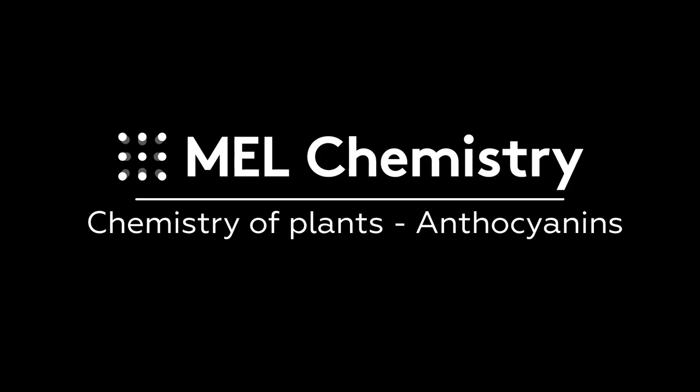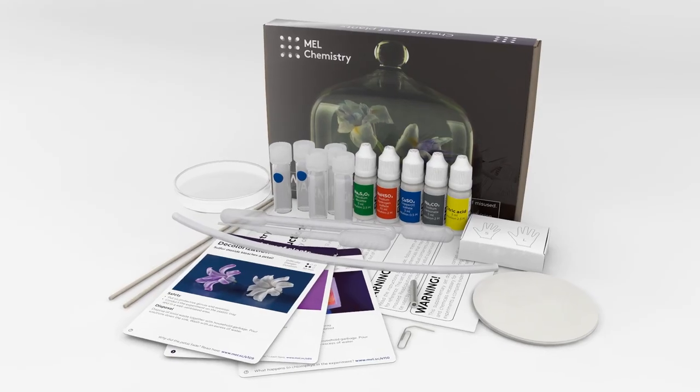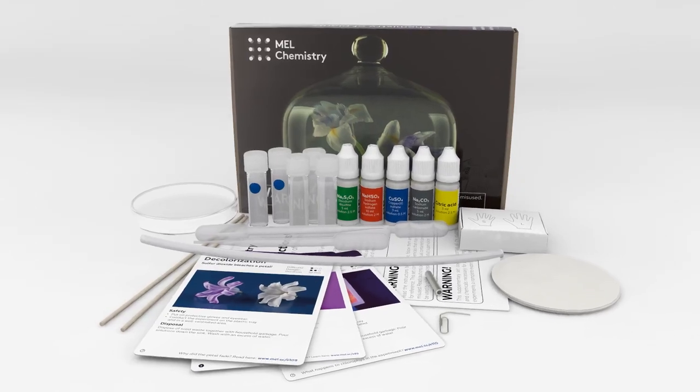Welcome to the wonderful world of chemistry. Today, with the help of the Chemistry of Plants set by Mel Chemistry, we will see how acidity affects the color of anthocyanins.